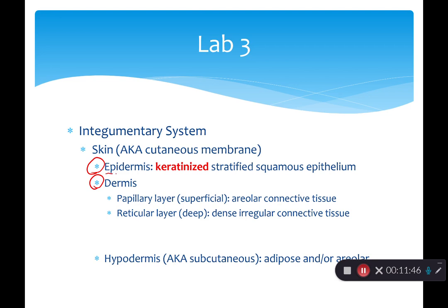The epidermis is keratinized stratified squamous. And that is one of the longest things you'll have to write on the first exam. Keratinized stratified squamous. That's what the epidermis is composed of. And that's a type of epithelium. We did epithelial tissues last week. We mainly focused on non-keratinized stratified squamous. That's probably the longest thing you'll have to write.